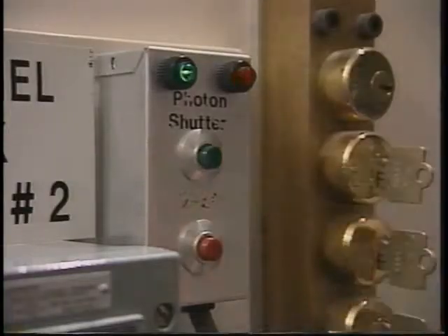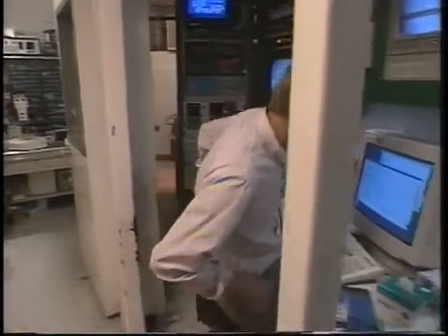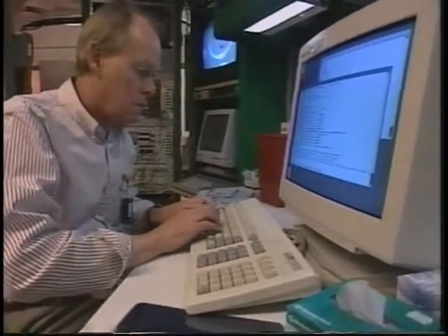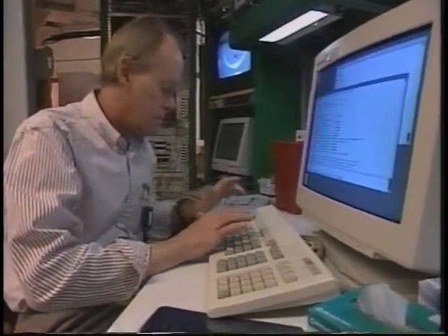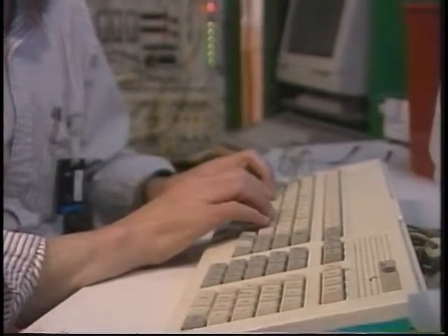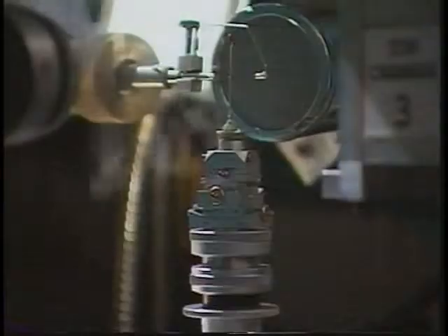For that reason, the facilities have necessarily made up procedures that are going to guard against that. You can't get close to the apparatus without first shutting down the beam. That's also an encumbrance. You can't do manipulations easily, and as a result, much of the facility is more automated than has been traditionally the case at home.